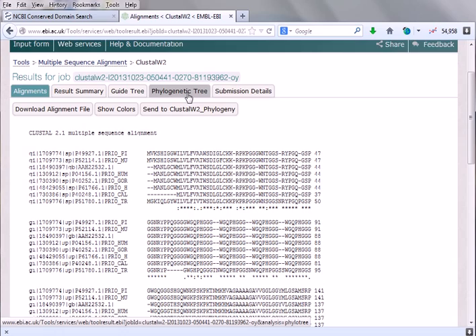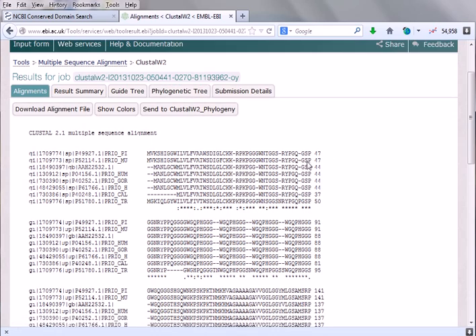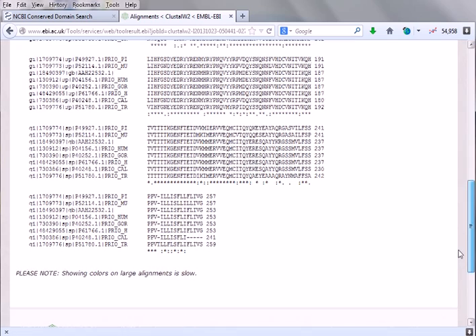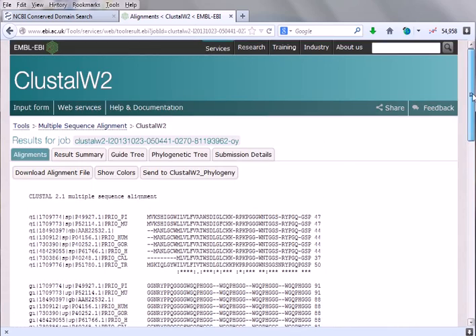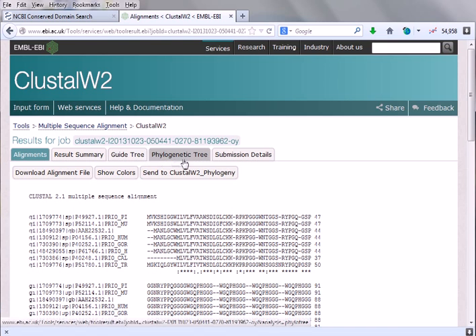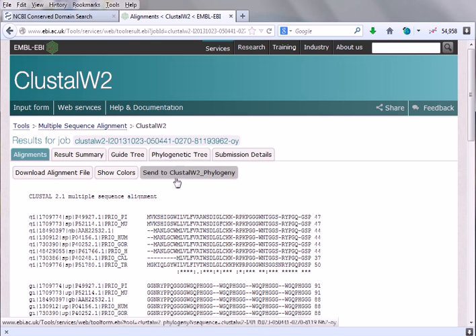We can download this alignment file. When you download this file, it will take us to the alignment file. Simply this alignment will be downloaded. For future purposes, we can simply upload this file for future use like producing this phylogenetic tree and all these things.